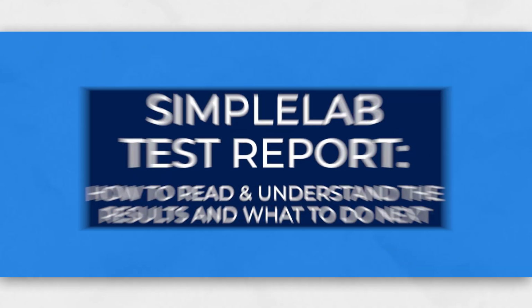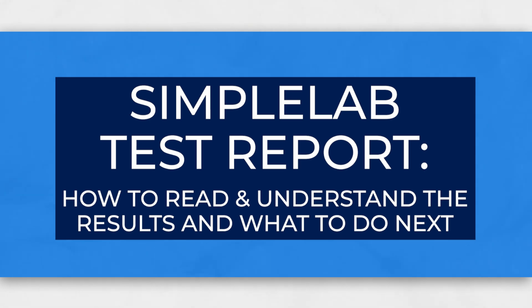So you just tested your well water with a SimpleLab Essential Well Water Test, and you got your report. So what does all that information mean? It can be a little confusing. That's why in this video, we're going to show you how to read the SimpleLab test report, understand the results, and what you can do next.